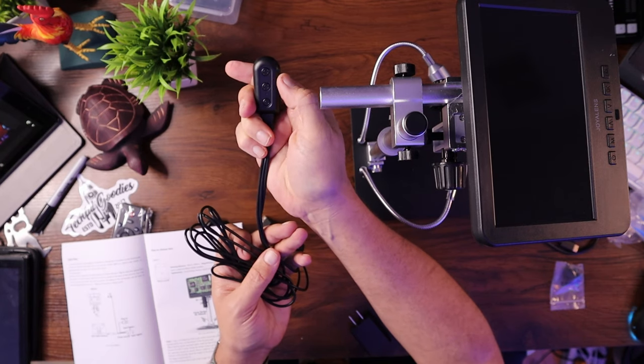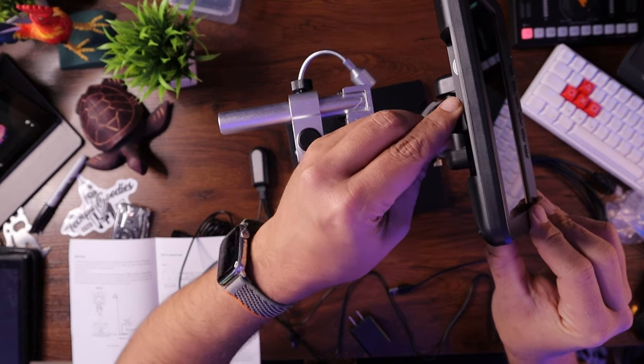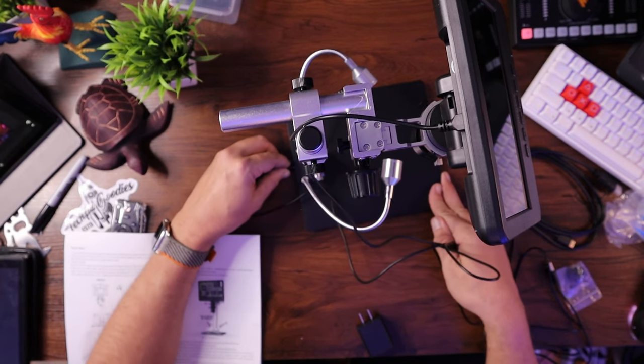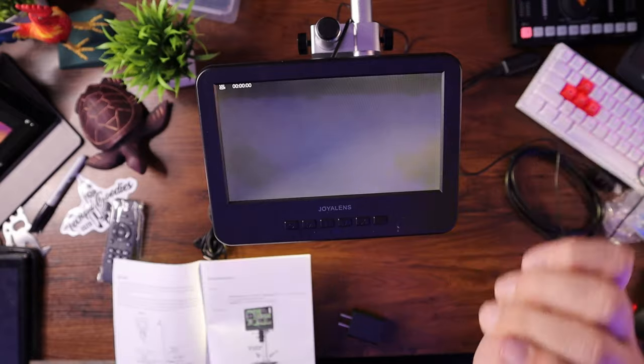The way they have this set up is they give you a cable with a little remote control for brightness up and down for the lights. The whole thing combines into a couple of different cables: a small cable that plugs into the back of the monitor to give it power, and a little DC adapter cable that goes in the back to give power to the lights. We can plug it into a USB port on your computer or a USB wall brick. Looks like we've got power — let's give this thing a try.